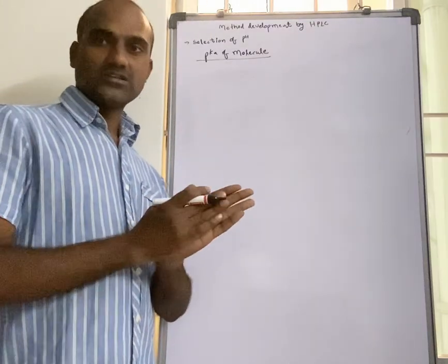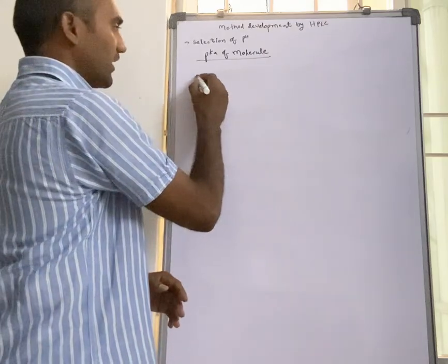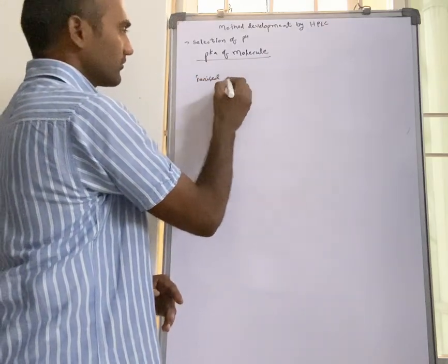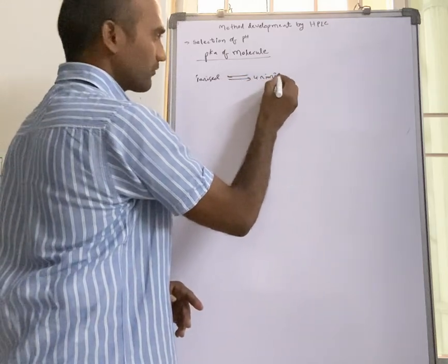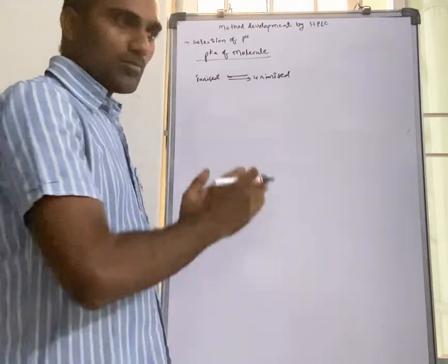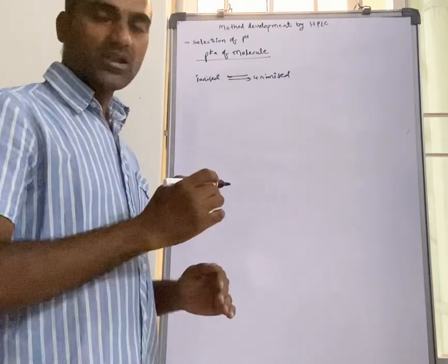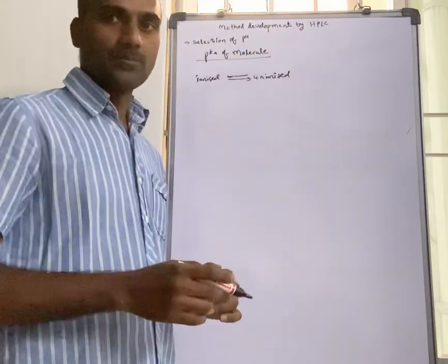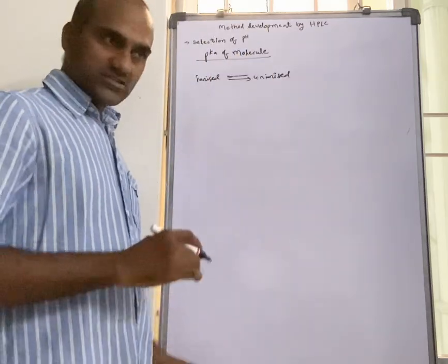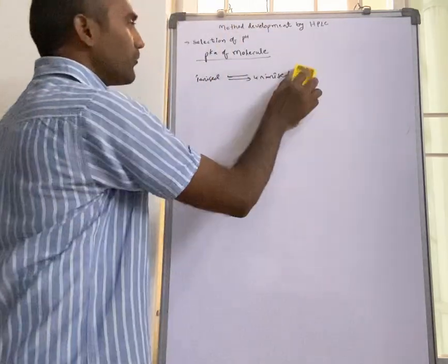If it is not in a single state, it will be in an equilibrium of ionized and unionized states. Some molecules are in the ionized state, some in the unionized state, so the peak will not elute as a single sharp peak. For some molecules we tried, the peak shapes are not improving.